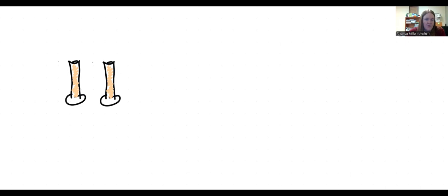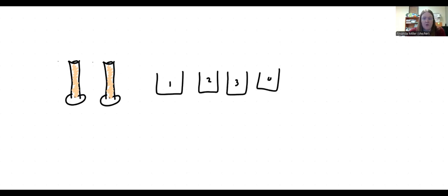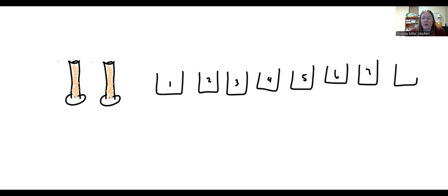Then we're going to have 8 cleaned beakers. These are going to be cleaned by you and your lab partner, so each of you would clean 4 of them using soap, which in lab is just called Alkanox. It's going to be on your chemical tray, but it's also in the gallon jugs that are all around the room.